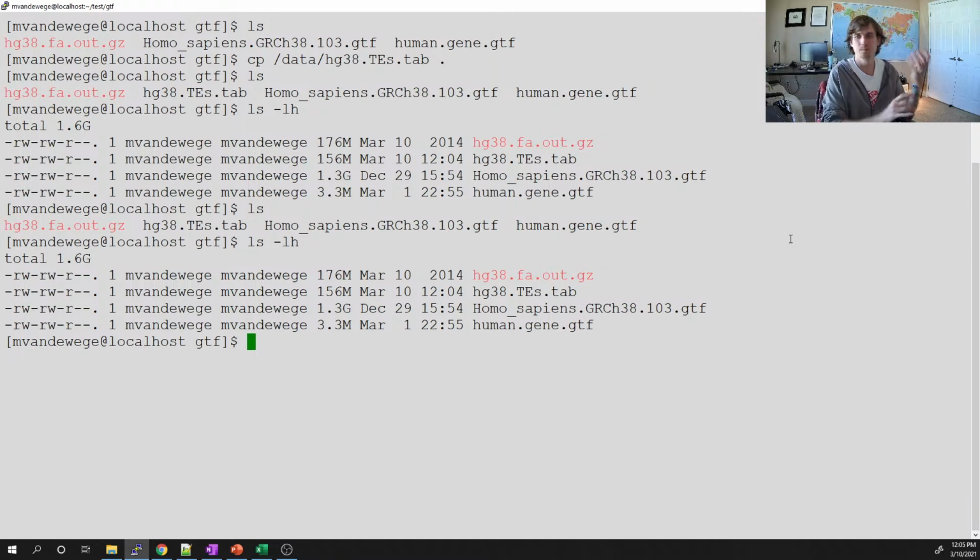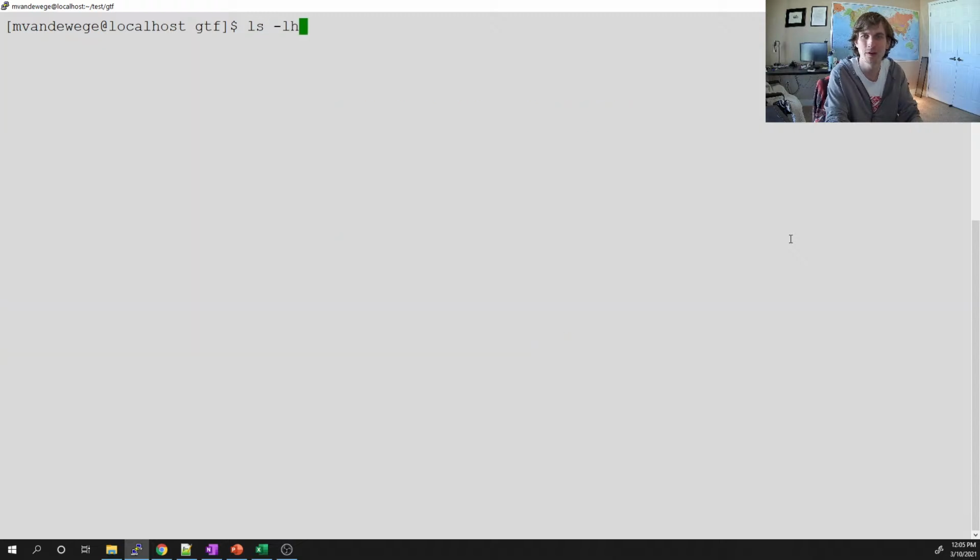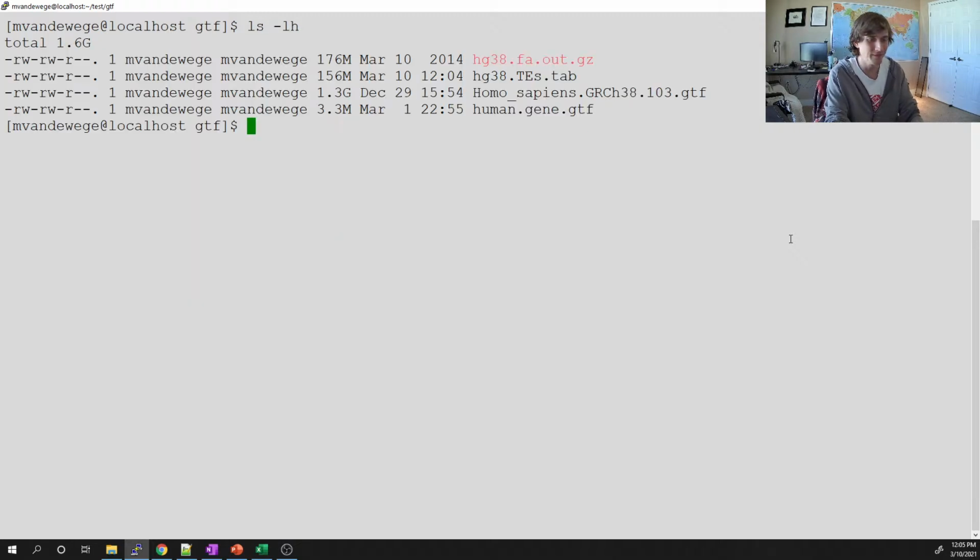All right, so let's see what we can pull out of some of this information, out of these massive files that are impossibly large to actually look at. And so I can introduce another special character. It's the up caret, and so this will be a Shift 6 button. And so what this character stands for is start of line.